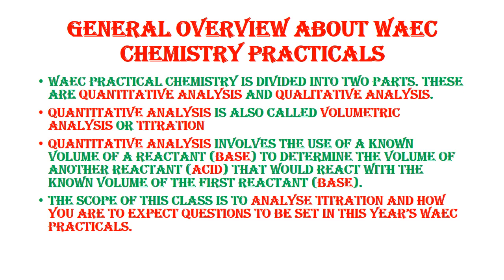So we know the volume of a particular reactant, and we want to get the volume of the other reactant to react with it. Am I communicating? The acid-base titration is a reaction between acid and base. The volume of the base is always known, which is 25 centimeter cube, and then the titration will be to determine the volume of acid that will react with that 25 centimeter cube of base.